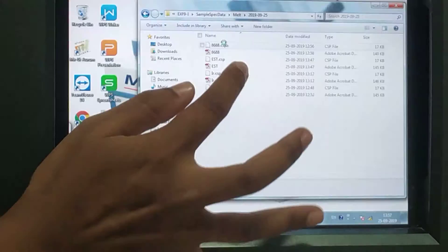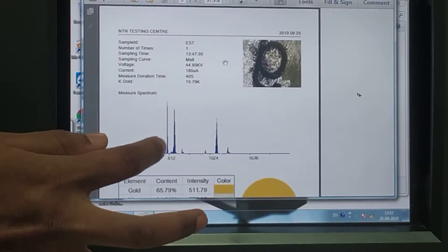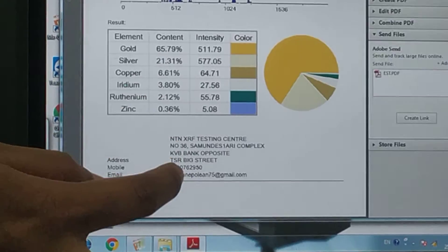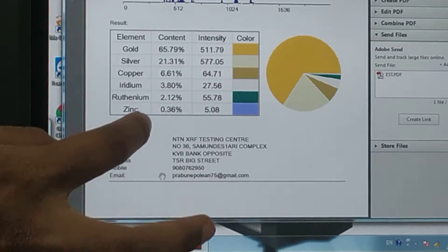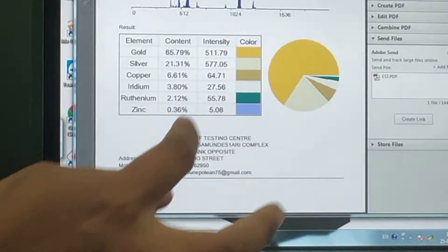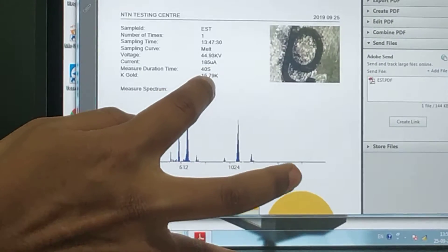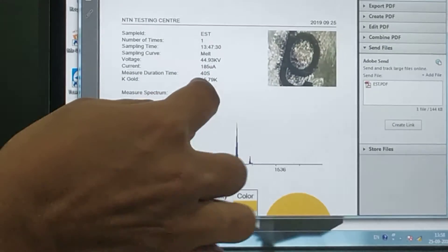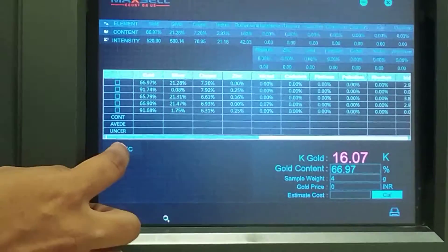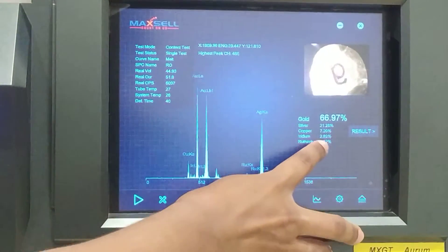Here we can see a result which was saved earlier for this sample. You can see what metals are present, what the percentage of each is, and what the testing sign and carat it contains.